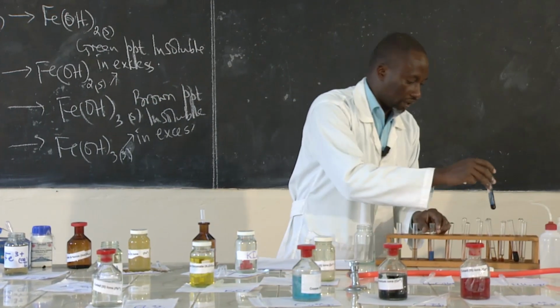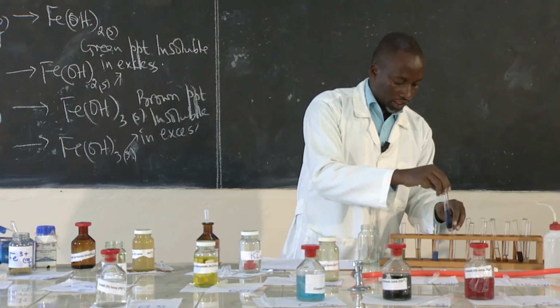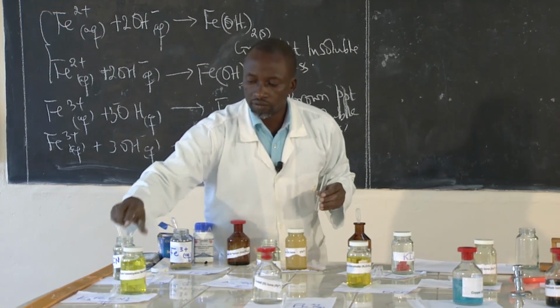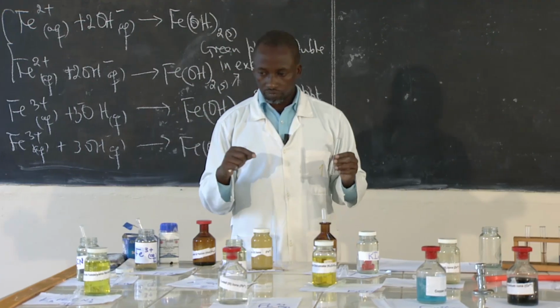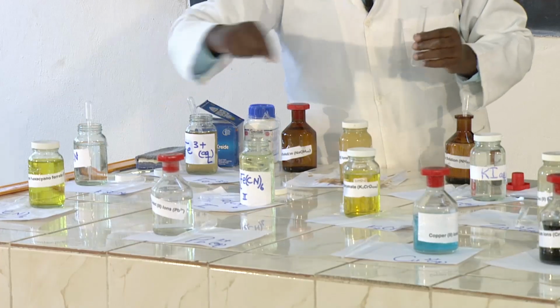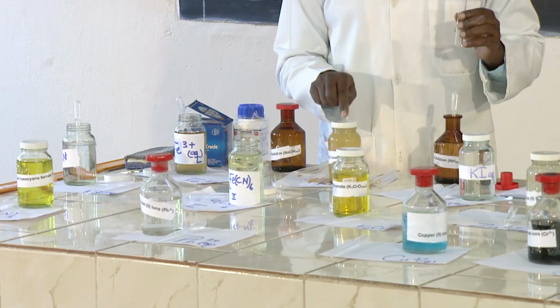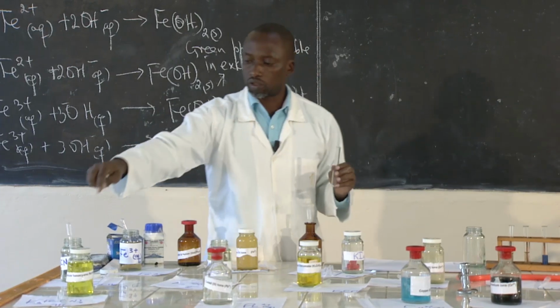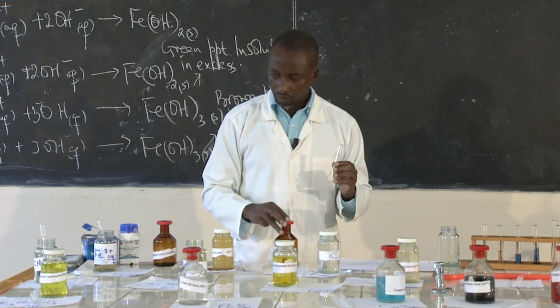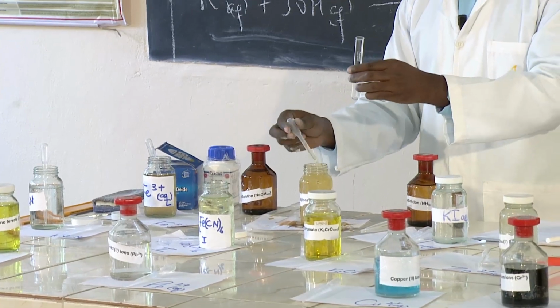So let's look at the potassium hexacyanoferrate 3 with these two compounds. So we have this iron 2. We are going to look at it with this one. Iron 2 first, some few drops.